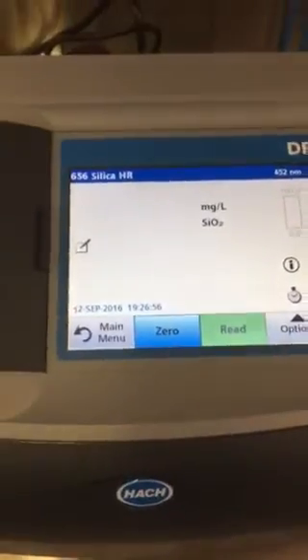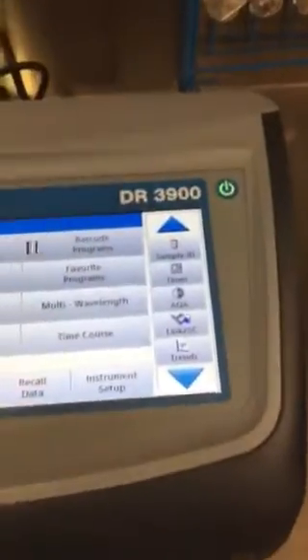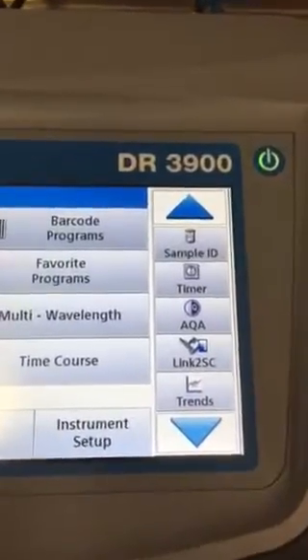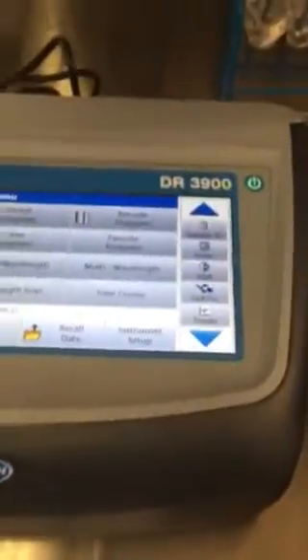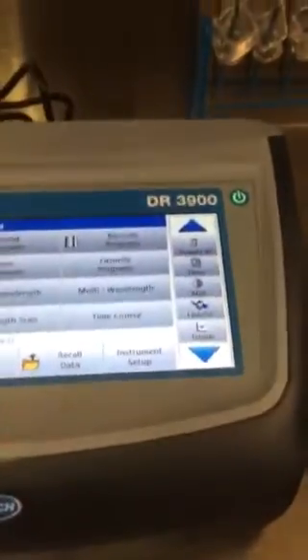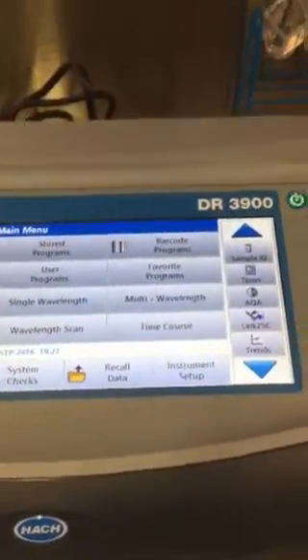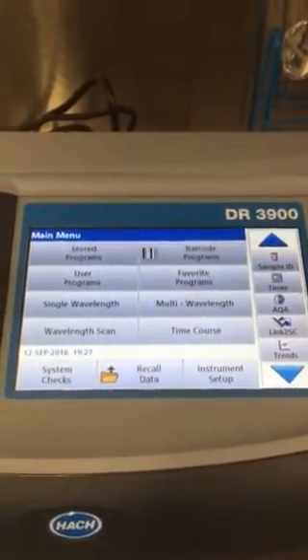Close the sample cell and hit either zero or read. Once you've used it for a while and have some tests logged, there's a trends button you can use on any test to see a trend of recent results. You can also hit recall data to pull up the last several tests that were done. It's a great tool — if you have any questions, give me a call.